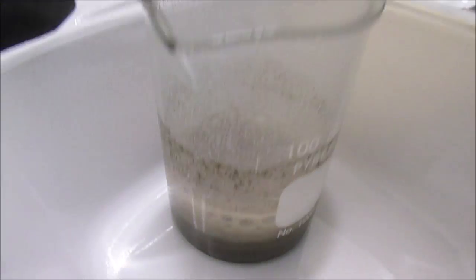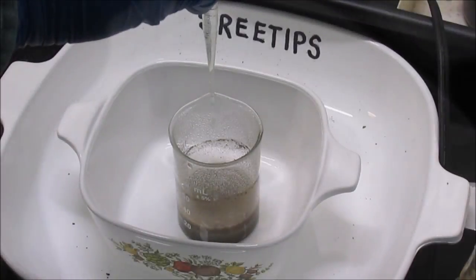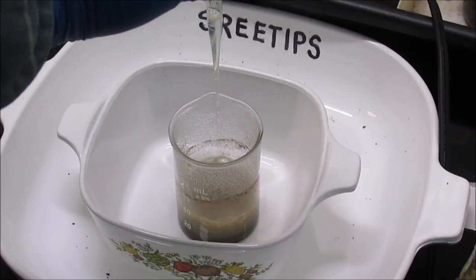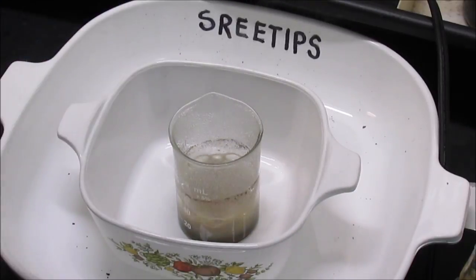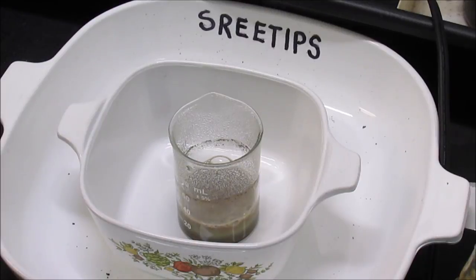Piranha solution is normally made by mixing three parts concentrated sulfuric acid with one part 30% hydrogen peroxide. But this 12% is all I had, so I'm using that. This is some nasty stuff and will dissolve skin on contact, so precautions must be taken to ensure that none of it gets on you.